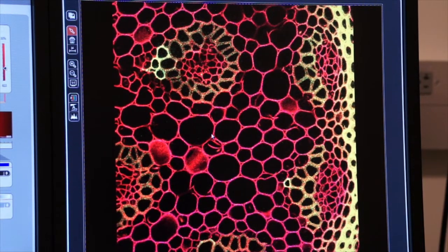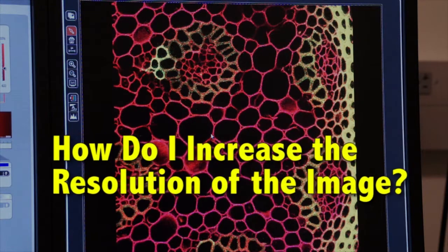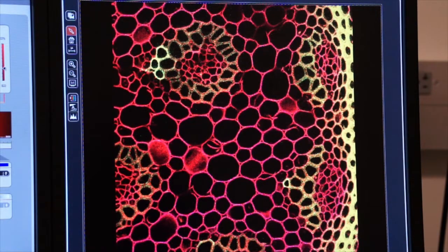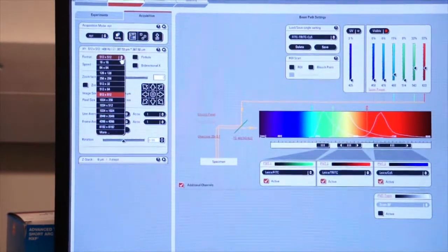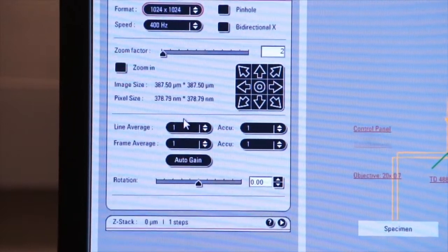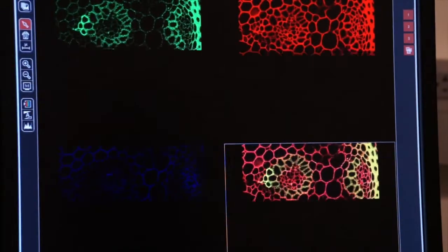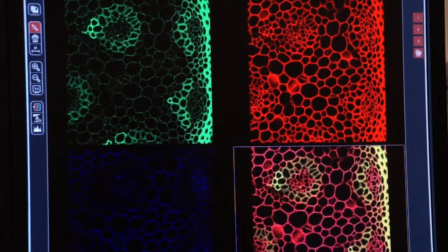How do I increase the resolution of this image? There are several ways to do it. I can go back over here to this screen and I can increase my digitizer resolution. So let's go 1024 by 1024. We'll click on capture image again. You'll see the system capture an image.